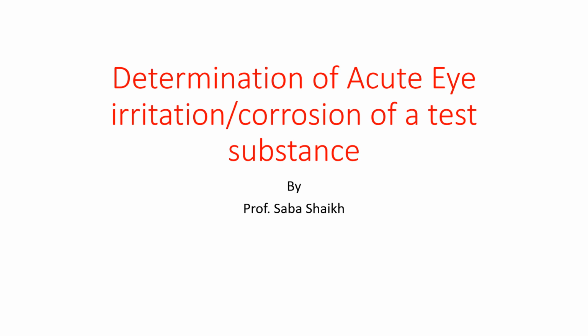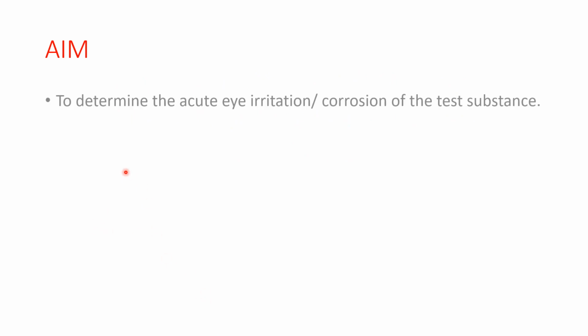Hello everyone, today we are going to discuss the determination of acute eye irritation or corrosion of a test substance by Professor Sabashik. So first we'll see the aim of the experiment. The aim of the experiment is to determine the acute eye irritation or corrosion of the test substance.